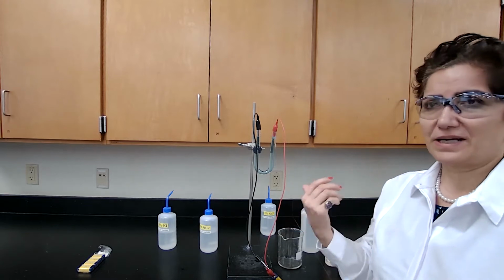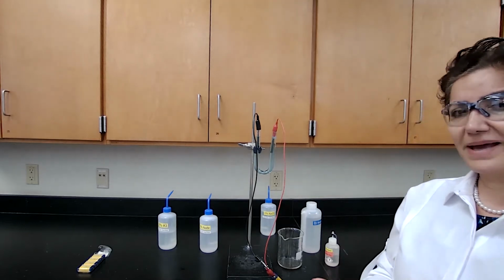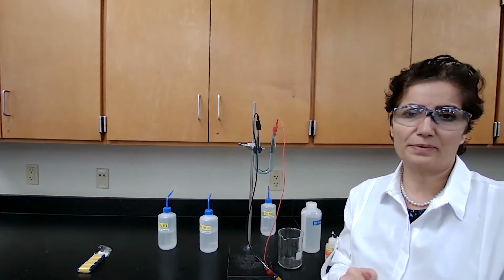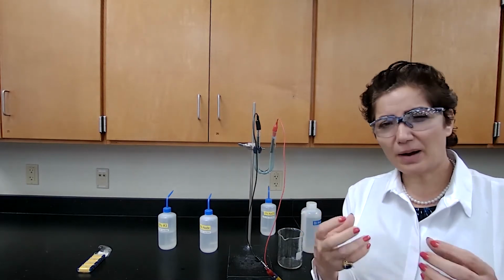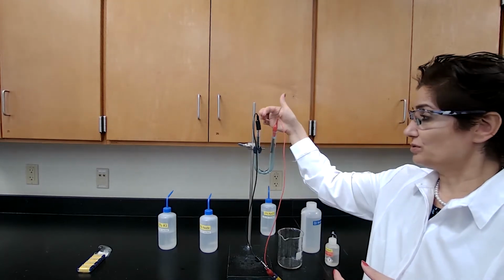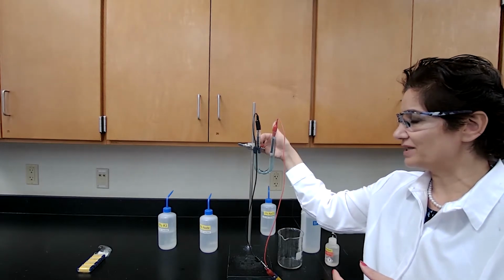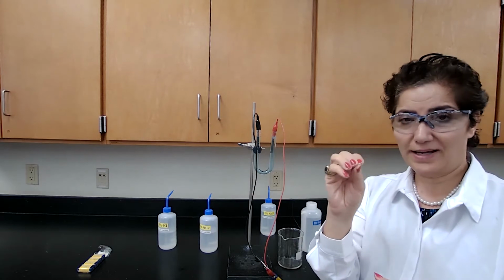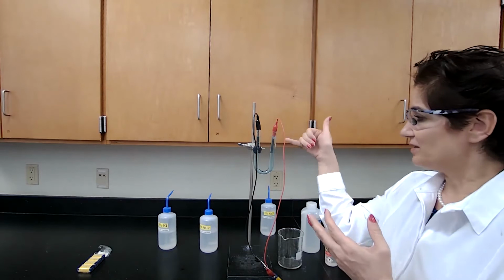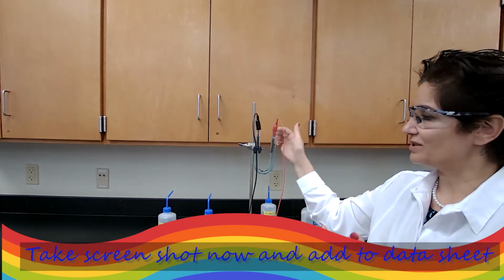What are the choices here? For the cathode reaction, where the reduction takes place, the metal, which is the copper 2+, would gain electrons and change to copper 0, which is copper metal. Since the electrons are coming through the graphite electrode here, copper ions would grab those electrons and be reduced, and they're not going to fall down, they would precipitate, or stay attached to this electrode.